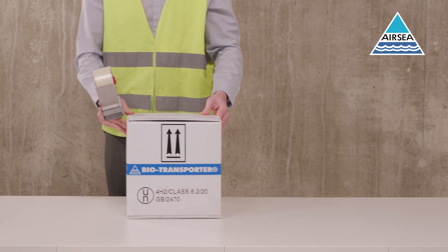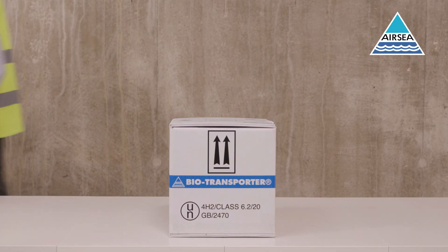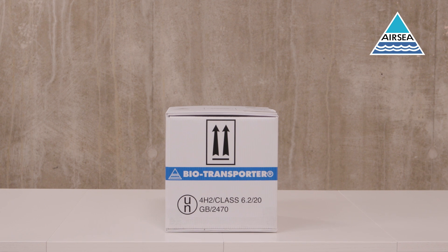Your product is now correctly packaged and ready for the appropriate hazard labels to be affixed and all other necessary consignment information ready for transport.